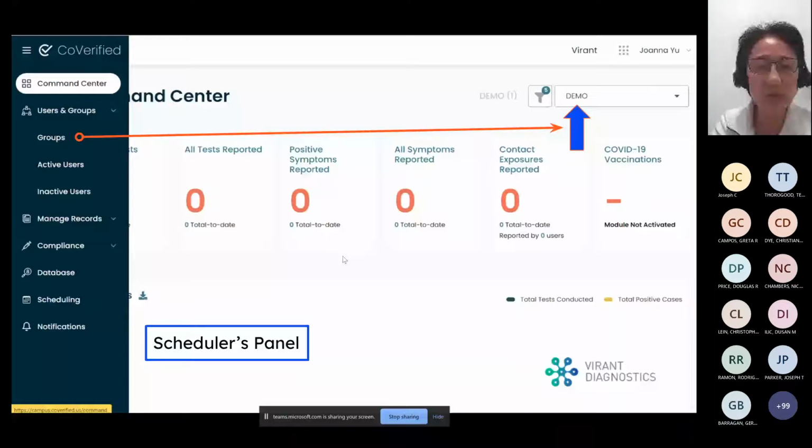And this is one thing I want to show everyone. If you are granted permissions to schedule and review the results, this is how your screen looks, the functions and logos, particularly on the left side. And then just make sure you are at the right place, meaning, for example, if you're OFO, I often use the OFO, you make sure this is under the right group. And that's where, if you've been granted a function, you will see all this panel function here.